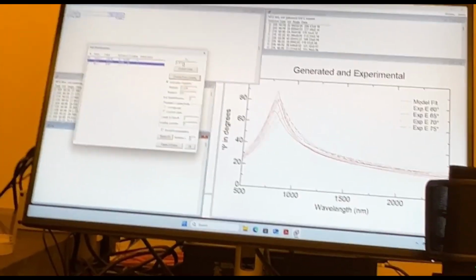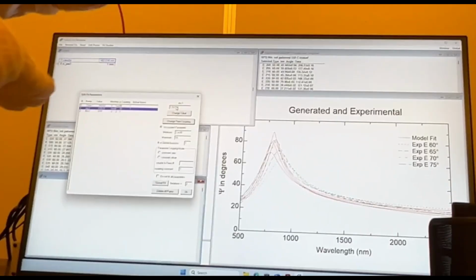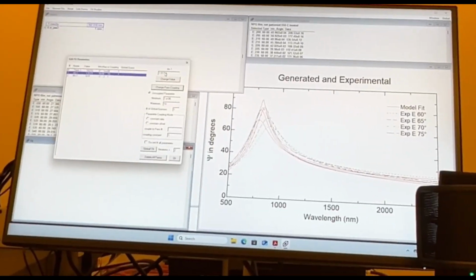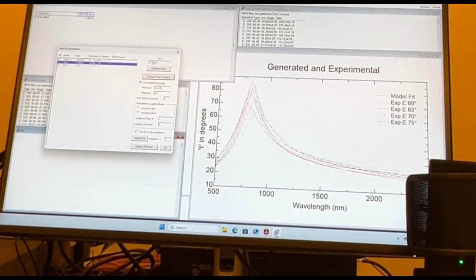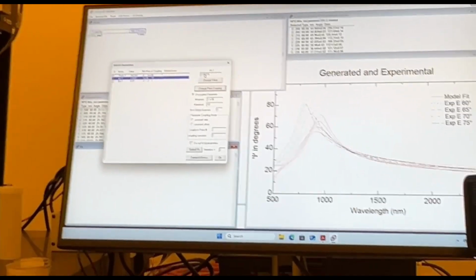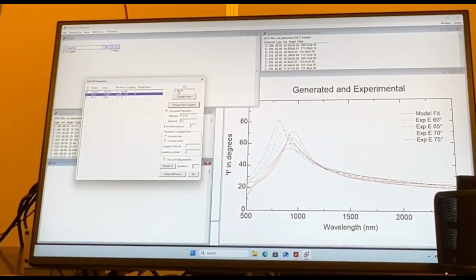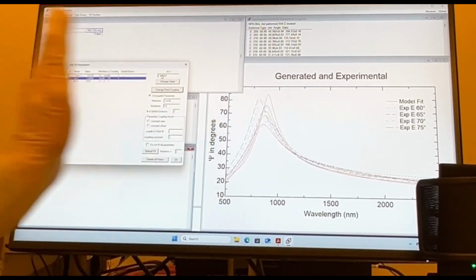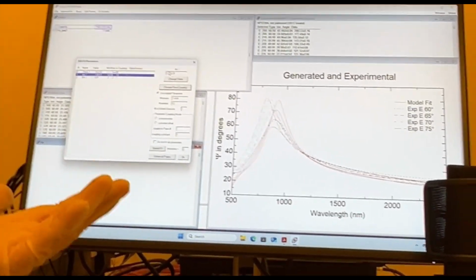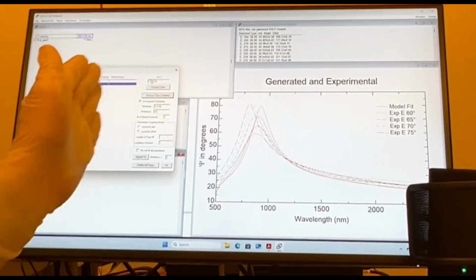That's air. So you have air, then the film, and then the silicon, so you have an interface of the air versus the film and the film versus the silicon. That also comes into play a little bit. But you can see that we're in the ballpark here as this changes. The other thing to note is remember when I changed thickness only, it just did a lateral shift. The peaks stay the same. When you change the index, it changes the peak to peak height, but notice it's also doing a lateral shift. That's because you're changing the optical thickness. Your index is changing, so that's also going to affect this left-right.